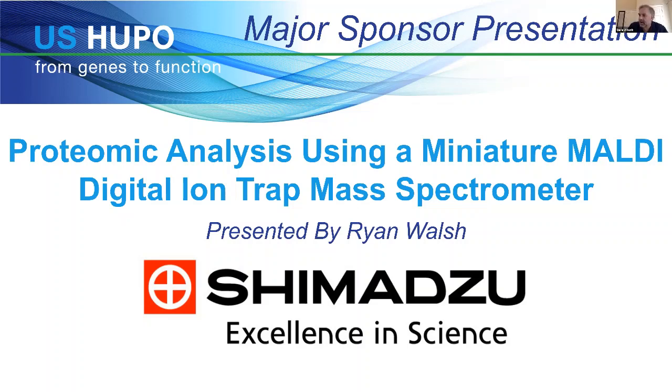Okay. And then another question that occurred to me, are there other ion activation methods that you could employ and maybe do some top-down proteomics? Essentially, at this time, it could potentially be possible to do other ionization methods.